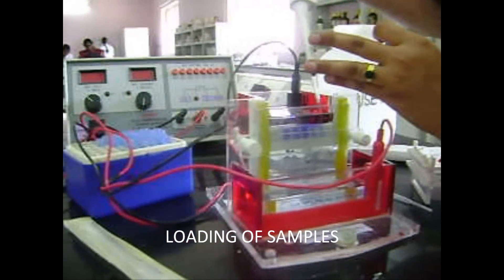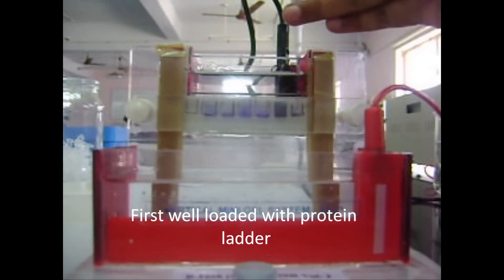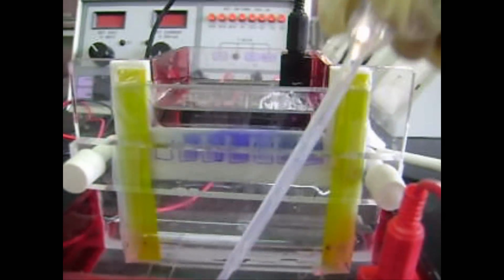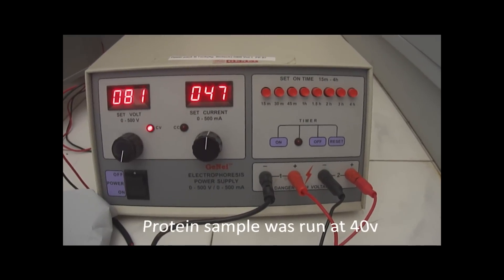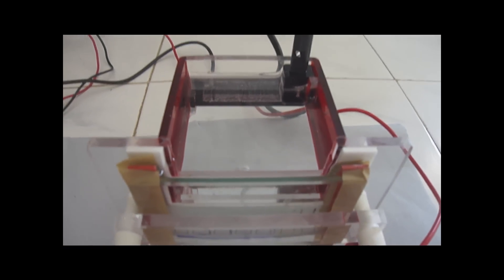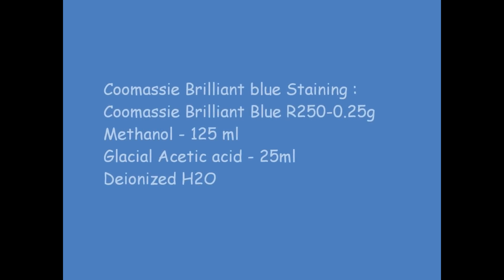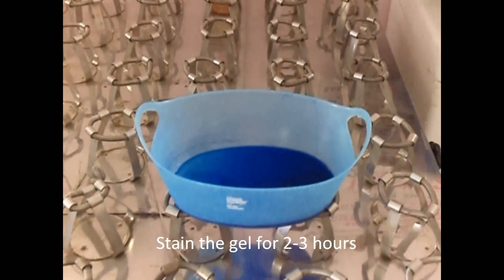Place the prepared gel plates in the vertical gel electrophoresis unit. Each well is uniformly loaded with 20 µl of protein sample. Add running buffer to the top reservoir and remove air bubbles safely. The unit must run at 40 volts, gradually increasing. Once complete, the gel is dismantled and the resolving gel is stained for 2 to 3 hours.